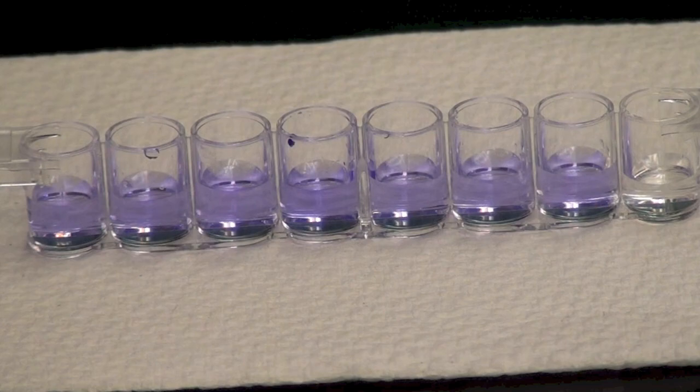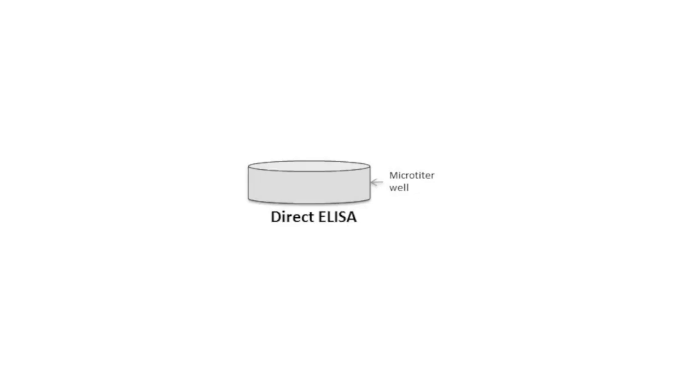Here is a quick animation to help you understand how ELISA works.